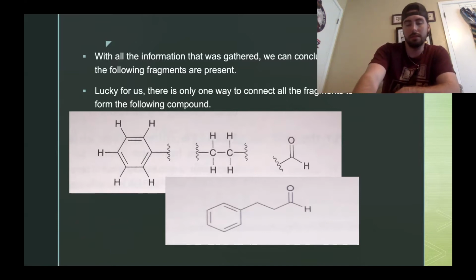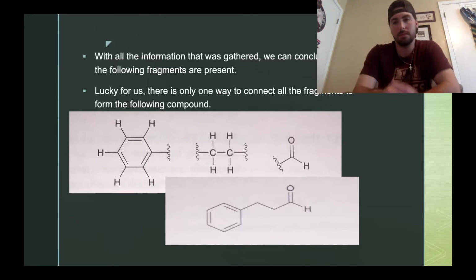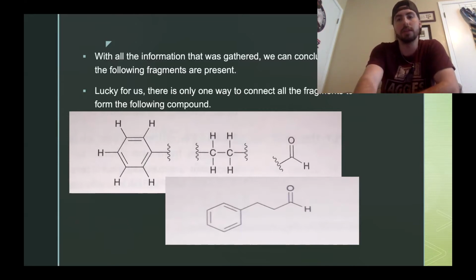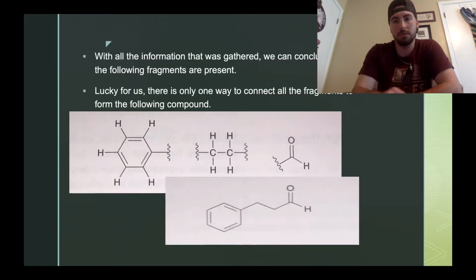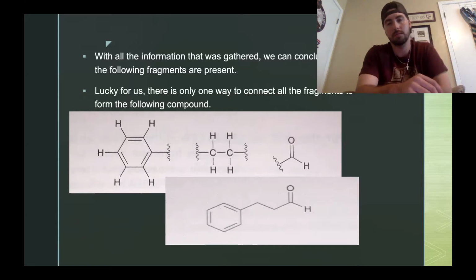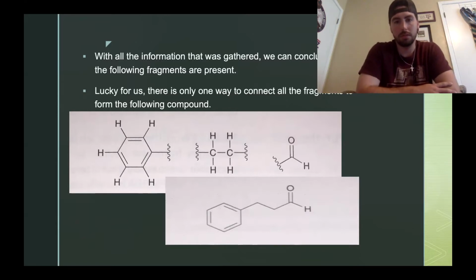So a couple of things. The HDI was calculated to be 5, right? Yes. The aromatic ring, you can leave it on there. The aromatic ring accounts for 4. So if you have an HDI of 5, and you see a peak around 7, you know there's an aromatic ring, and then there's something else.